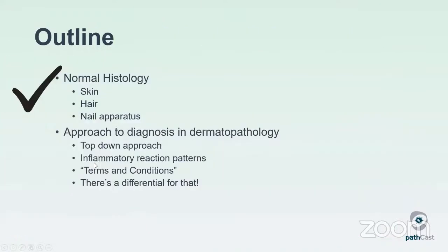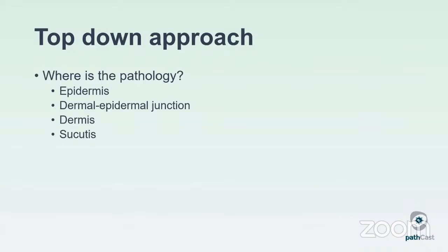But I think this is just a lovely photo, illustrating that and showing it side by side with the schematic. All right, so we've covered our normal histology of hair, skin, and nails. Next, I would just like to touch on an approach to diagnosis in dermatopathology.